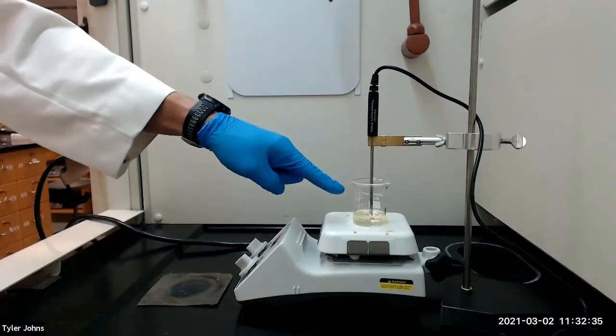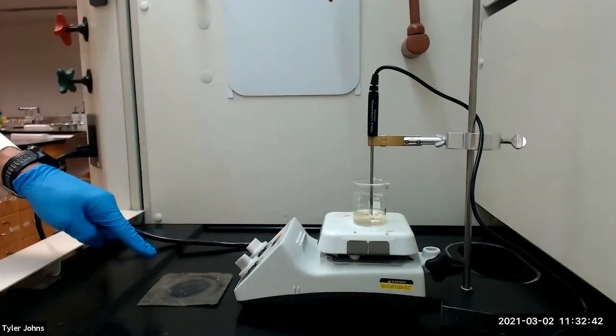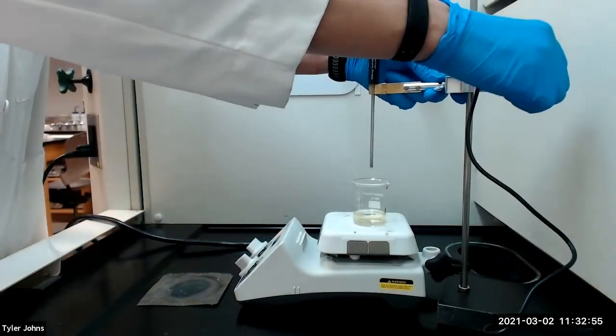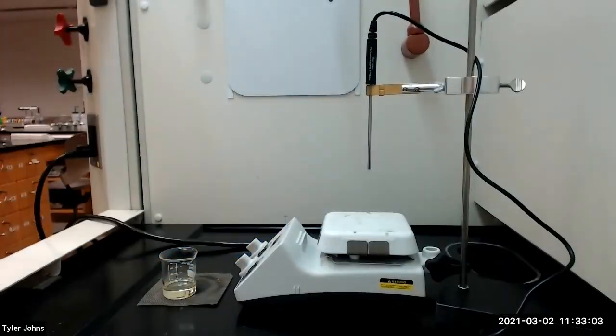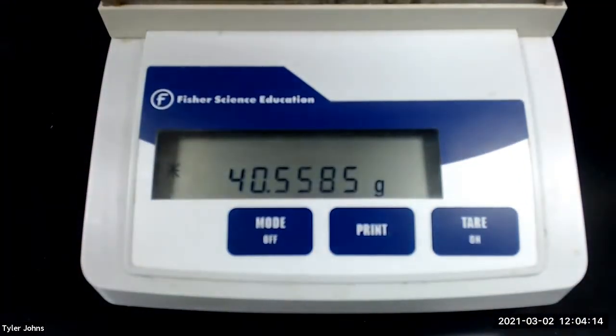After heating our beaker with our biodiesel for 15 to 20 minutes, we will next remove the beaker from the hot plate and allow it to cool to room temperature. After cooling to room temperature, the mass of the pre-weigh beaker and the biodiesel is 40.5585 grams.